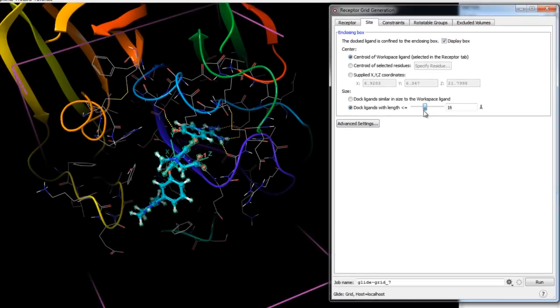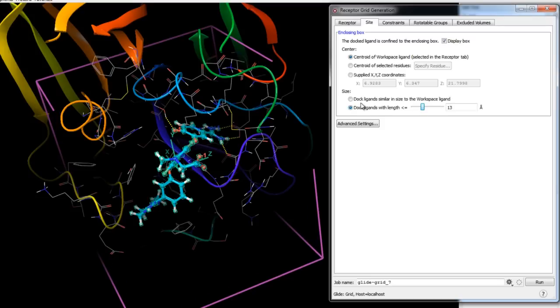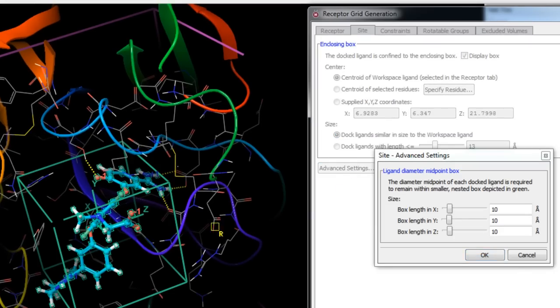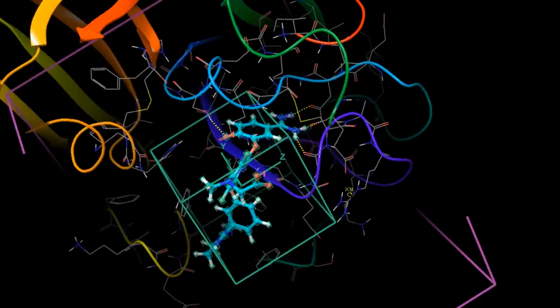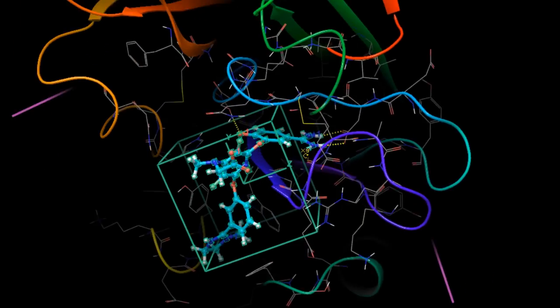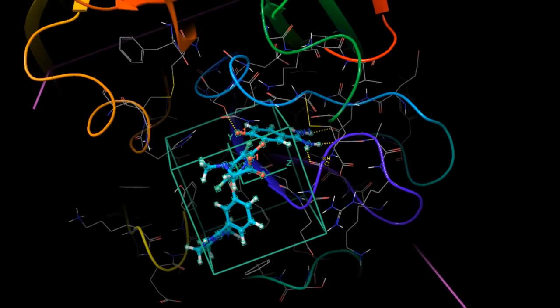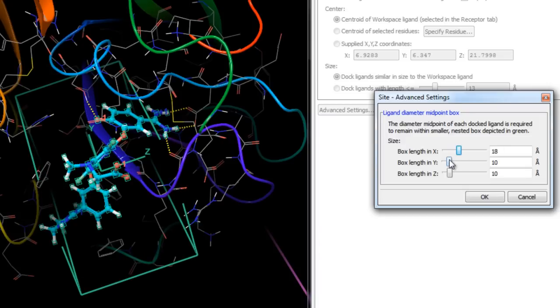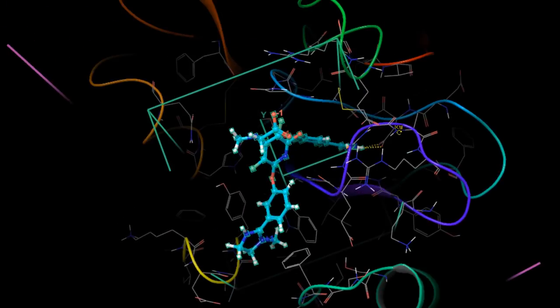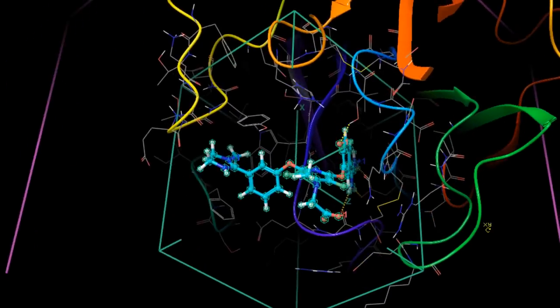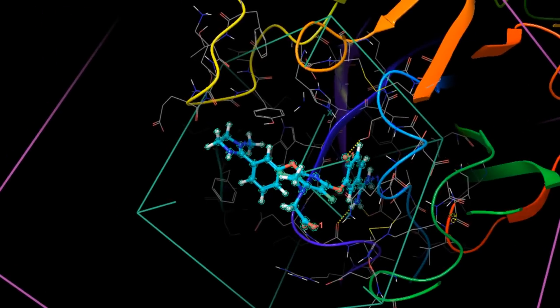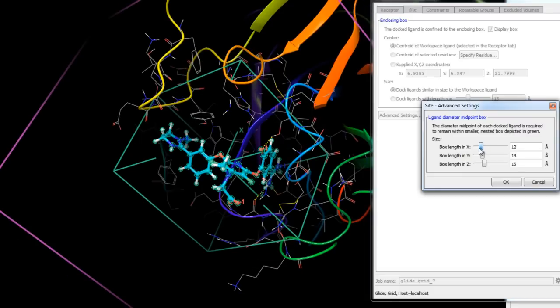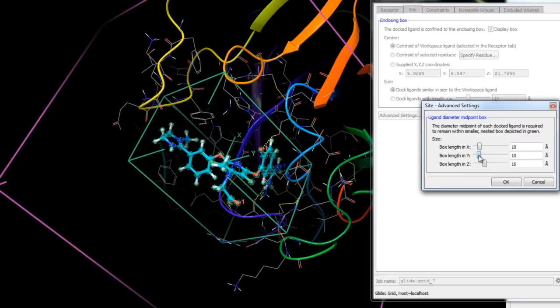Generally it is best to make the enclosing box as small as is consistent with the shape and character of the protein's active site and with the ligands you expect to dock. The advanced settings show an inner green box — the ligand center box — which defines the acceptable positions for the ligand center during the site point search. You can adjust the size of this box in X, Y, or Z space to allow ligands to find unusual or asymmetric binding modes, or to confine their midpoints and save calculation time.